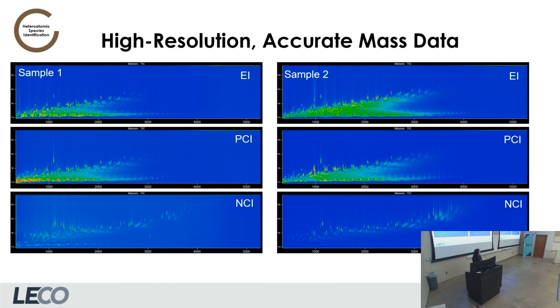And those are species that you expect to be more electronegative. After playing around with this, you can see that there are a lot of amines in these samples, as well as double, triple, some of them even have 4 oxygens on some of these things that you don't otherwise see in the EI. It gets covered up with all the other signals, but with negative CI, they're highlighted.